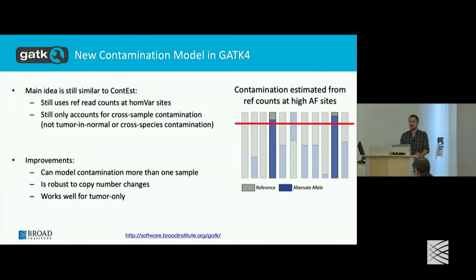Does this new algorithm require a matched normal? It does not. It will probably work better if you do have a matched normal, but it's still able to work very well without. So yeah, matched normal is optional.